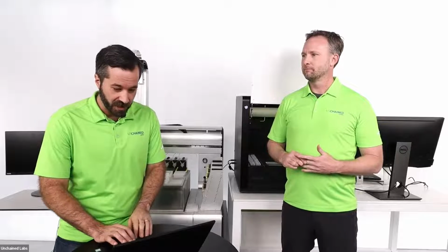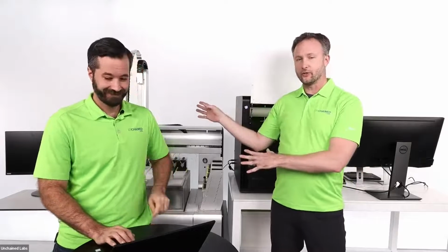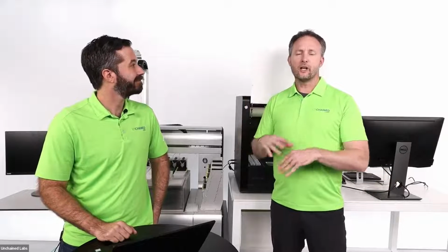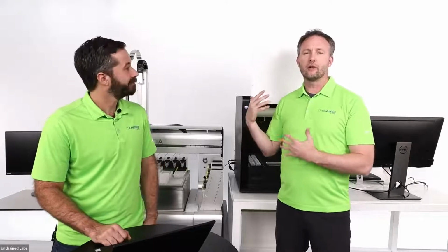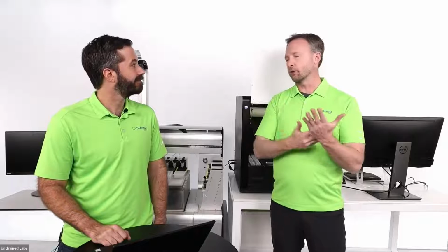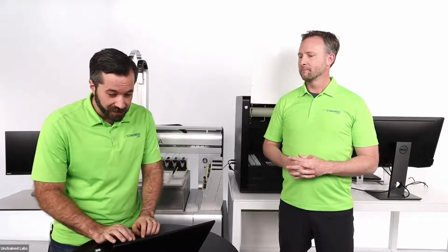So then next question. What happens if I run out of tips? Right, yeah, so high throughput on Big Tuna, lots of tips needed, of course. And then Unagi, less tips, but good question, I suppose. If it happens on either instrument, the instrument will pause and you'll get a notice sent to you. If you have the Unagi configured, that notice can come on your mobile device. Cool, that sounds like a super useful feature. Yeah.